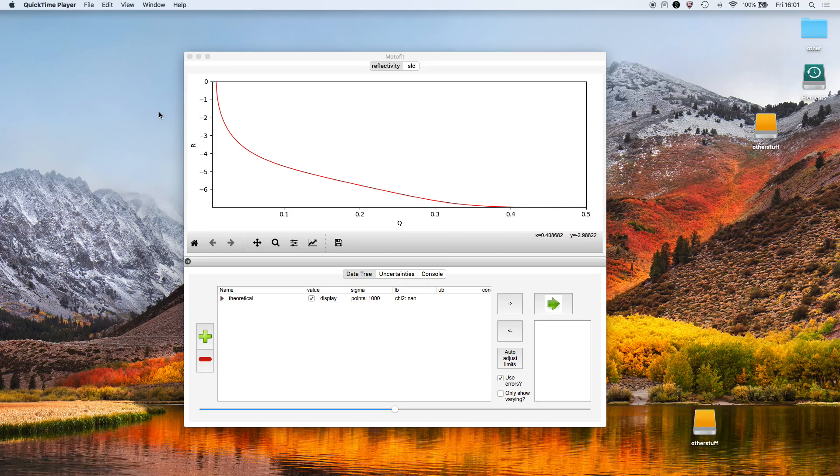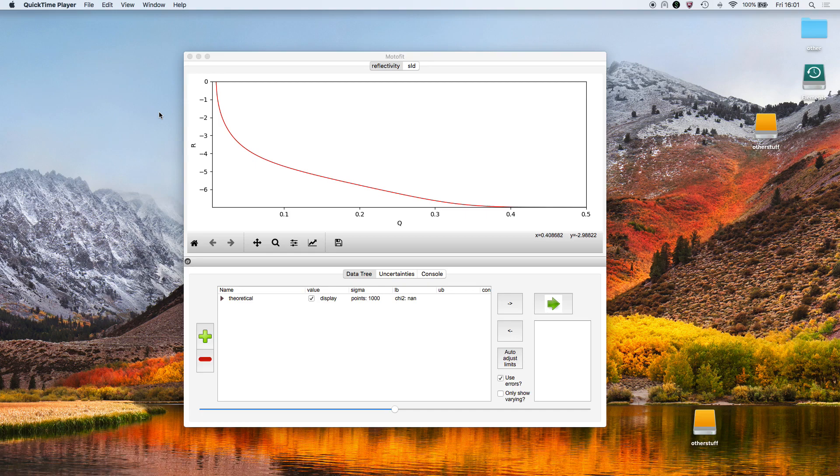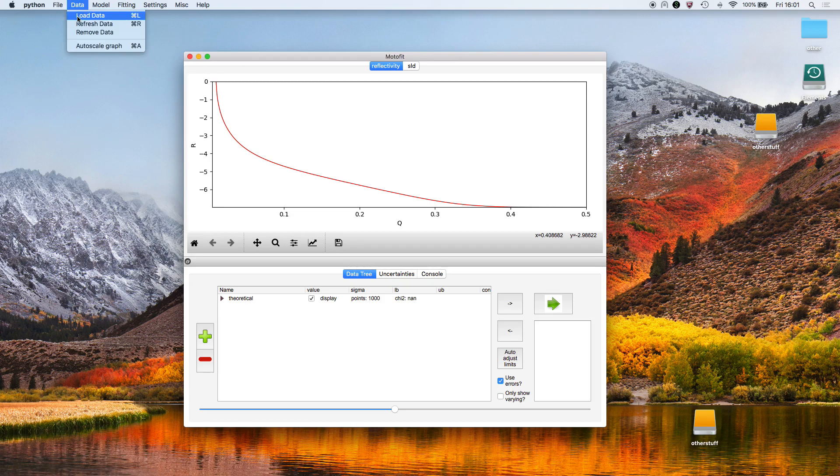We're going to do a simple fit of some data, the easiest thing that we can do to start off with. We're going to open a dataset.